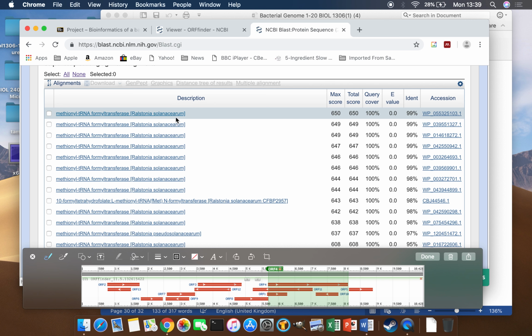Great, awesome. And that's the one I was expecting that you would find. This is what we got these samples from Colombia, and they were damaging banana crops. And you never know exactly for sure what a bacterium is until you sequence its genome. But this is at least one piece of data that says it probably was Ralstonia like we thought.